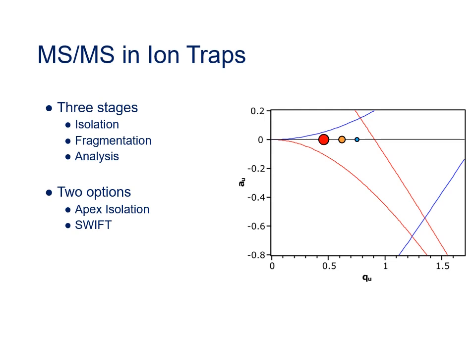But then if you didn't know exactly what ions were in your ion trap at any one time, you wouldn't know what frequencies to create. So let's turn the whole idea on its head. If we know the oscillation frequency of the ion we want to keep in the ion trap, well, why don't we create all the other frequencies except that one, and that will guarantee we eject all the ions except the ones we want.